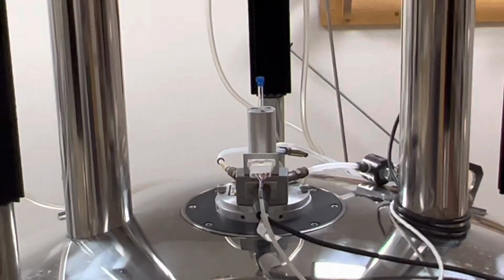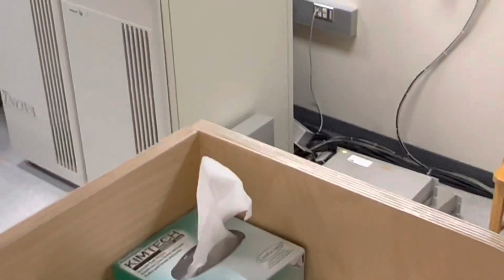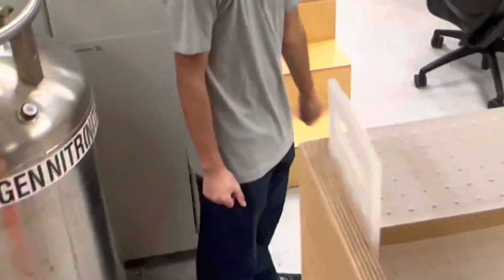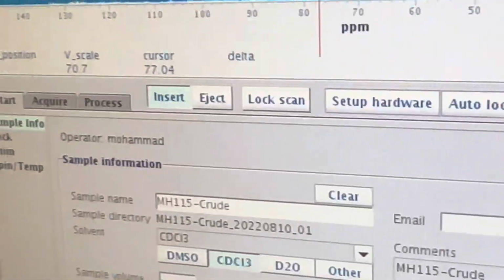Now this sample is up and I'm going to take it out. Do we need to put anything in? No, it's a little different from the Bruker. In the Bruker NMR we have to put in a dummy sample, but with this NMR machine we don't need to. At the finishing moment you type I and click enter, or you can type INS for insert.